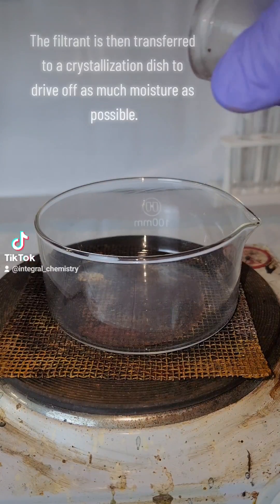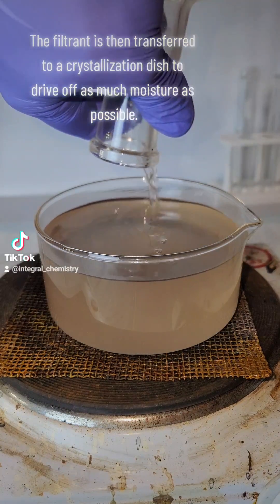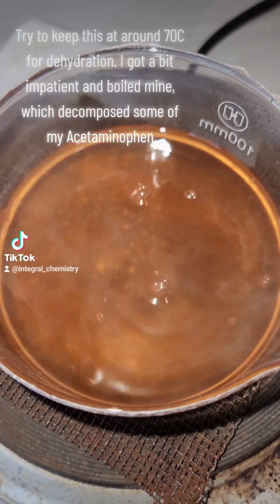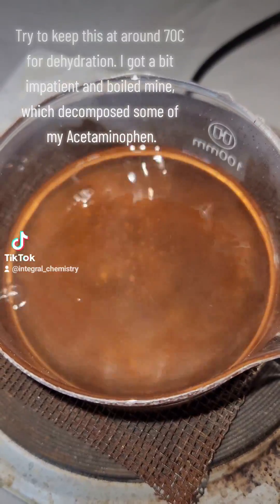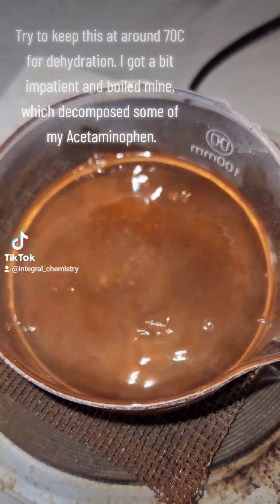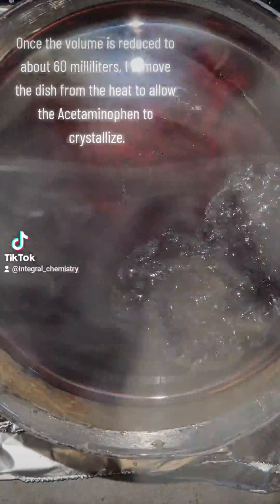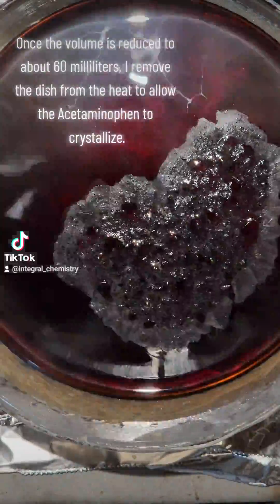The filtrate is then transferred to a crystallization dish to drive off as much moisture as possible. Try to keep this at around 70°C for dehydration. I got a bit impatient and boiled mine, which decomposed some of my acetaminophen. Once the volume is reduced to about 60 ml, I remove the dish from the heat to allow the acetaminophen to crystallize.